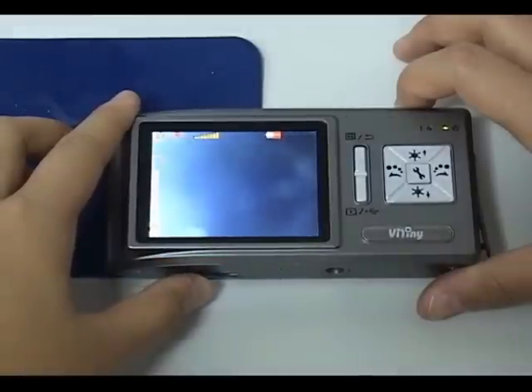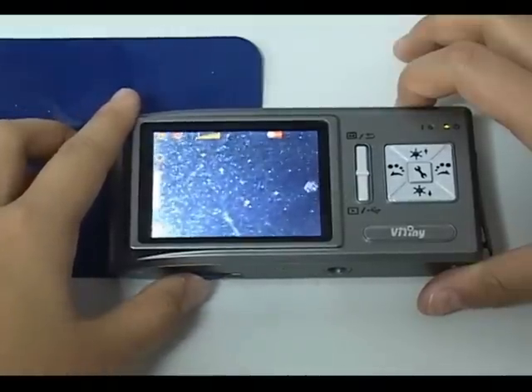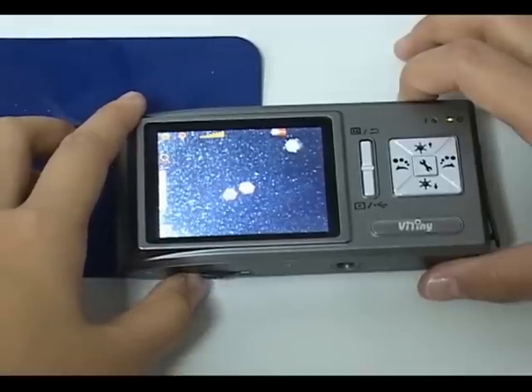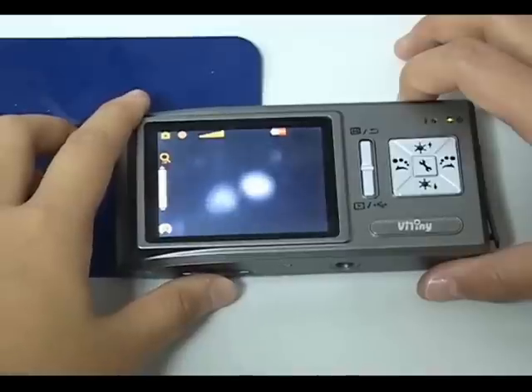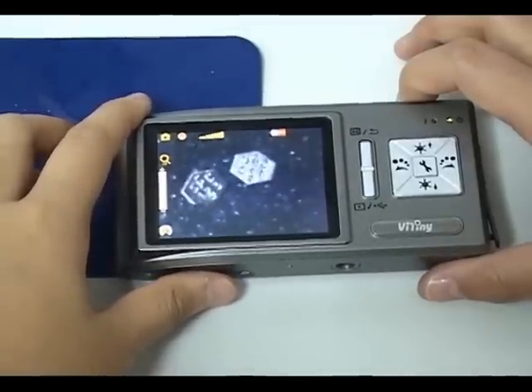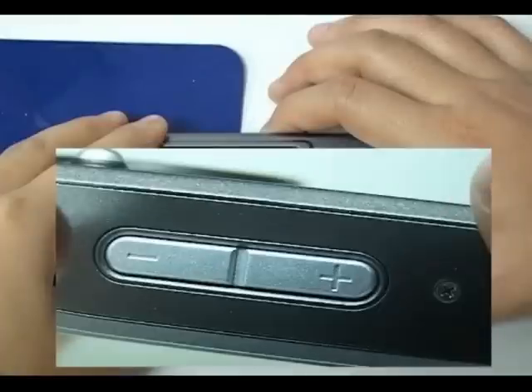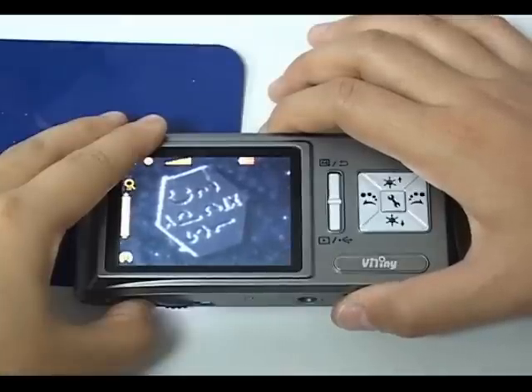Adjust focus to make the image clear. Press Zoom In or Zoom Out button to adjust image size.